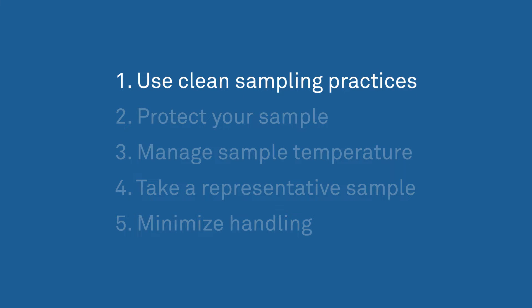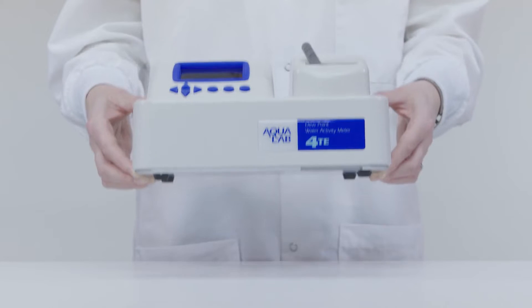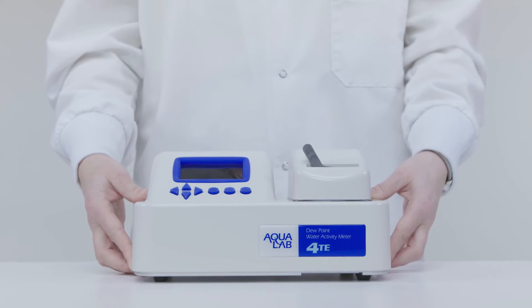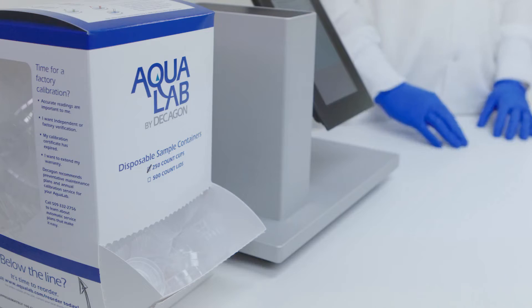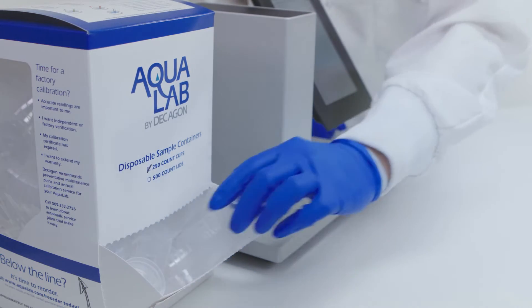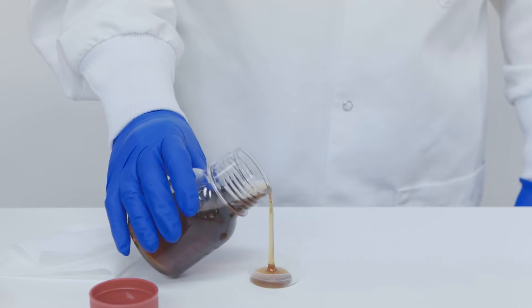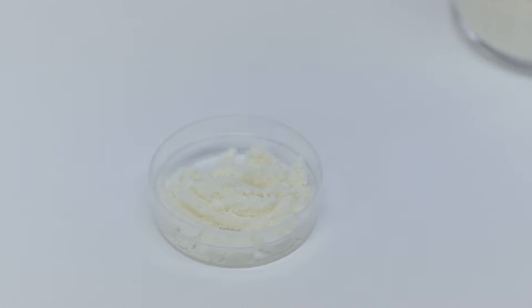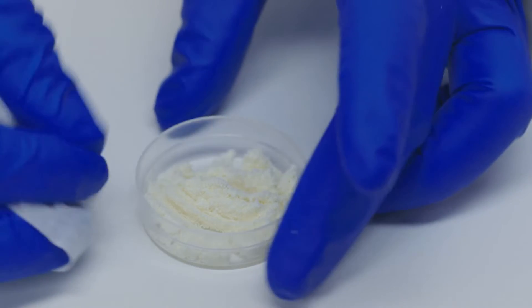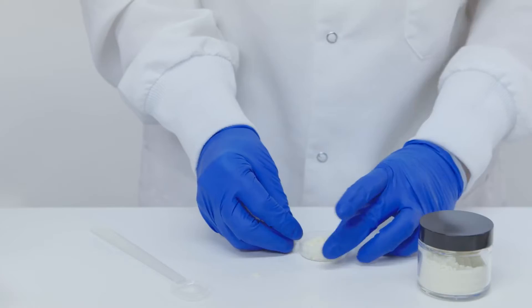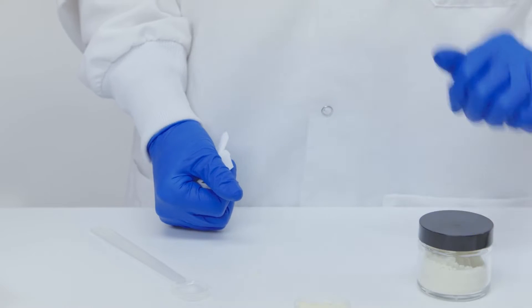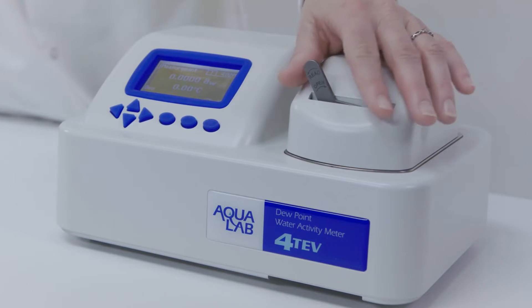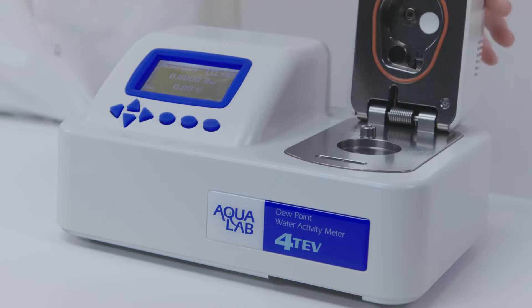One, use clean sampling practices. Place your instrument in a clean location. Make sure you have clean hands or wear lab gloves. Use a clean sample cup for each reading. Fill your sample cup no more than half full. Wipe the bottom, the edges, and the rim of your sample cup with a Kimwipe before putting it in the instrument, so you don't contaminate the sample chamber. Even small amounts of water or contamination can significantly affect the reading.